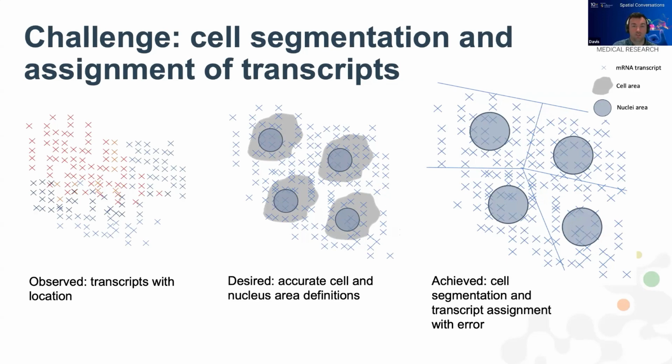And so we have transcripts from two different cells that end up being assigned to a particular cell that we observe with some level of confidence. And that's the more intractable part of cell segmentation that I think doesn't have such an easy solution, perhaps technologically. So that's a whole set of challenges that we might keep in the back of our minds while we try to do good data analyses when it comes to these things, and also things we might think about in the process of developing new, better bioinformatic tools for helping with these sorts of analyses.